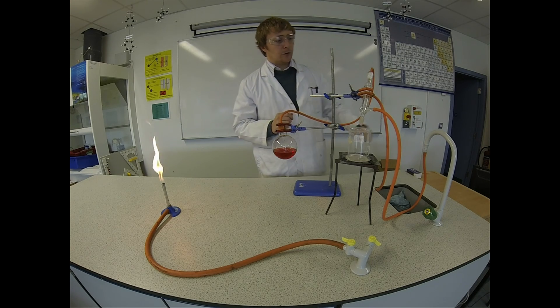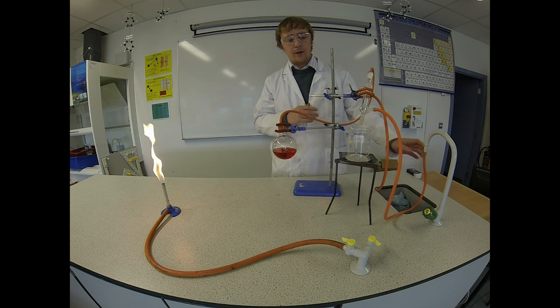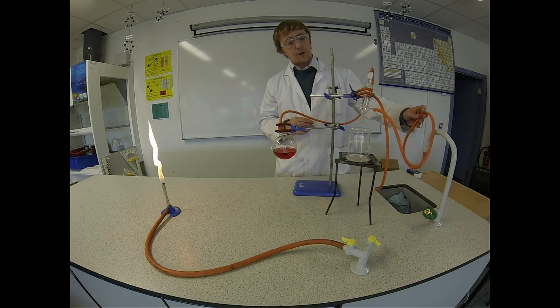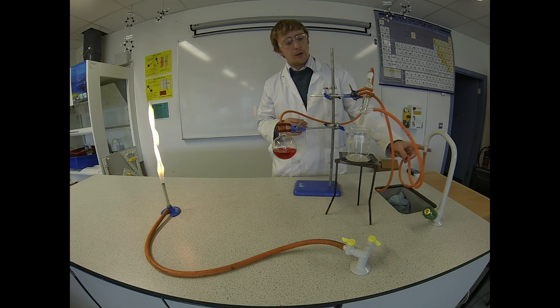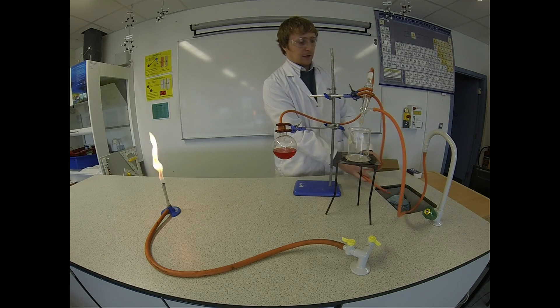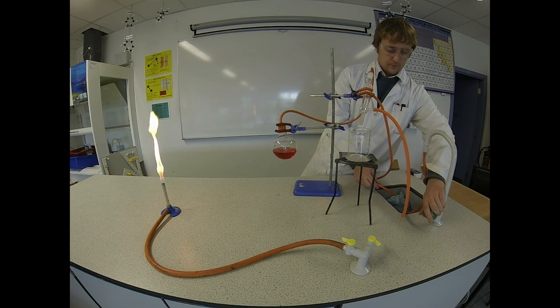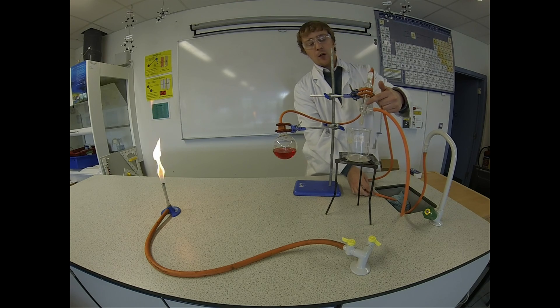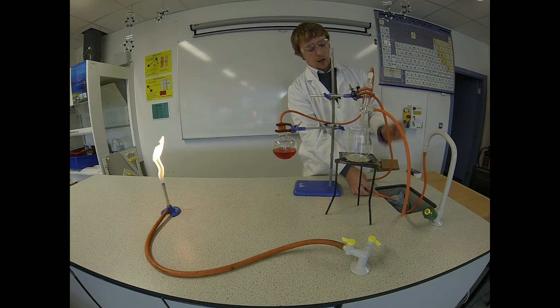The first thing I'm going to do is turn the water on to flow through the Leibig condenser. It's important that you have the bottom hose going to the tap and the top hose going into the sink. This lets the water flow from the bottom up through the condenser to the top.